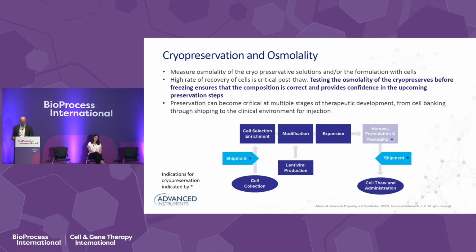Okay, now we're going to take a look at the cryopreservation process. The cryopreservation of cells and the final drug product is an essential step in the whole process within cell and gene therapies. Cryopreservation is meant to preserve the integrity of the drug substances and their critical quality attributes, and therefore maintain a high rate of recovery of cells post-thaw. By testing osmolality of the cryopreservatives and solutions before freezing, you can assure the composition is correct, providing confidence in the upcoming preservation step.